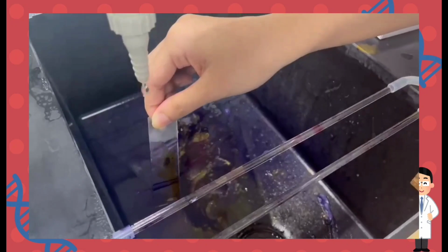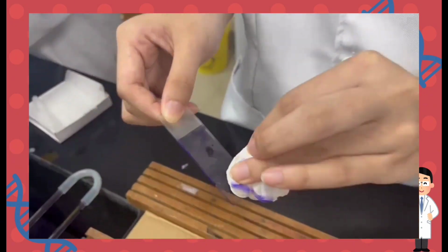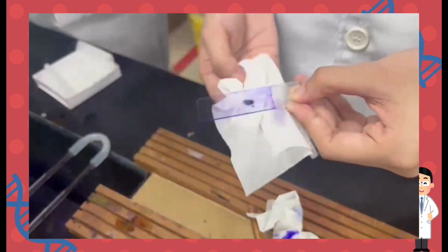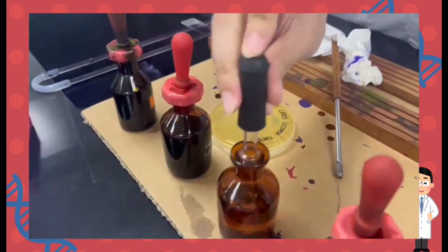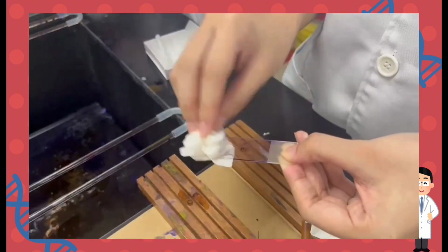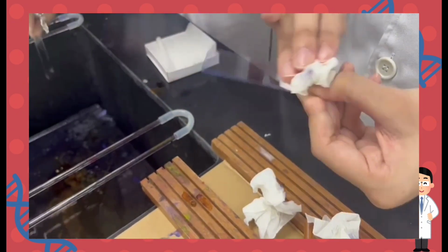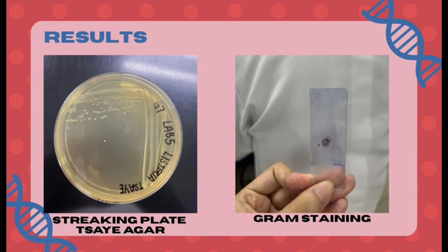In period 4, presumptive dark colonies displaying esculin hydrolysis were picked from our isolation plates and subcultured onto tryptic soy agar with yeast extract or TSAYE for morphological purity, and stabbed into tryptic soy agar with blood to set up our hemolysis observation. Finally, in period 5, we evaluate our TSAYE plates under oblique light and perform gram staining and microscopy analysis. Let us examine the empirical results gathered from our practical.